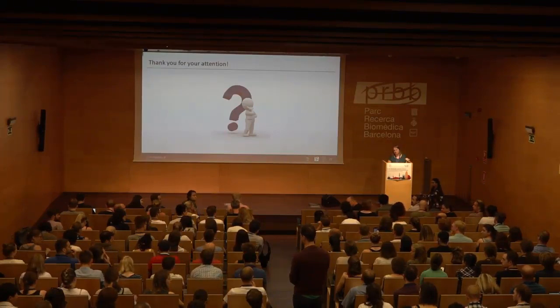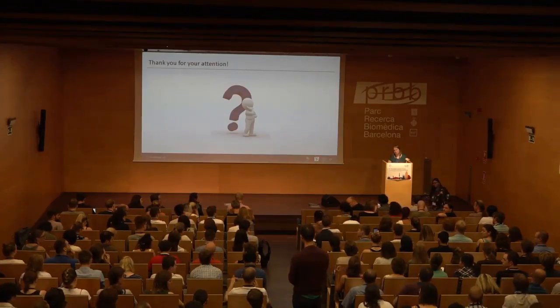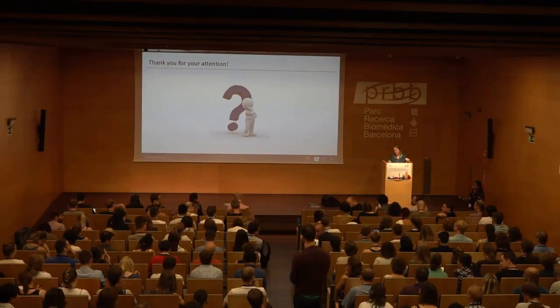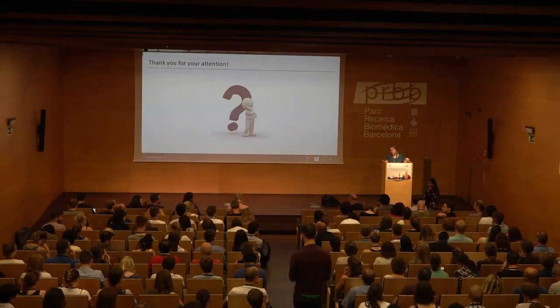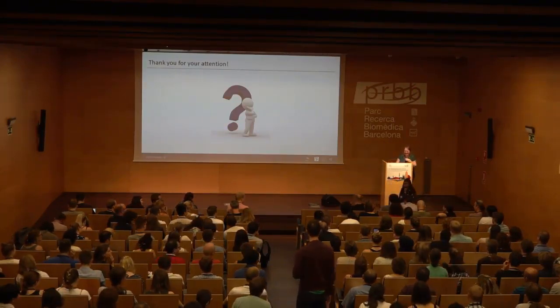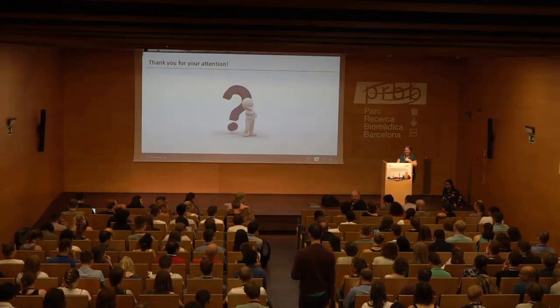I was wondering whether there is a probability of breakage of the peptide sequence that can also be taken into account, and in the future maybe considered as a physical agent that can break your proteins. Jürgen? You can make an unrestricted search at the moment to find breakage products. I think that would be the way to go at the moment.